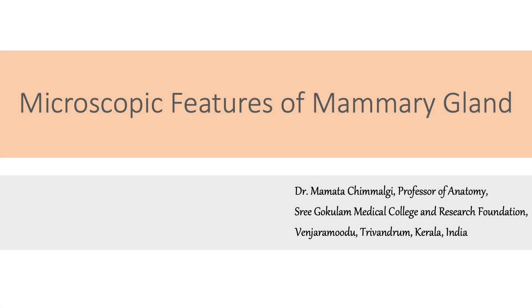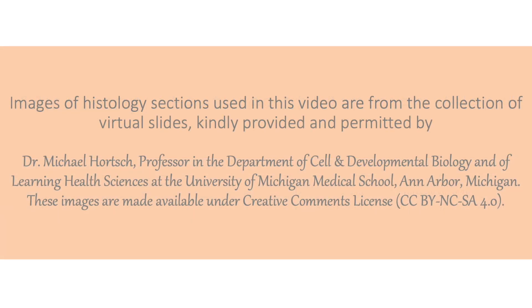Let us consider the microscopic features of mammary gland. I am grateful to Professor Michael Horsch of University of Michigan Medical School for providing the images of histology sections used in this video.